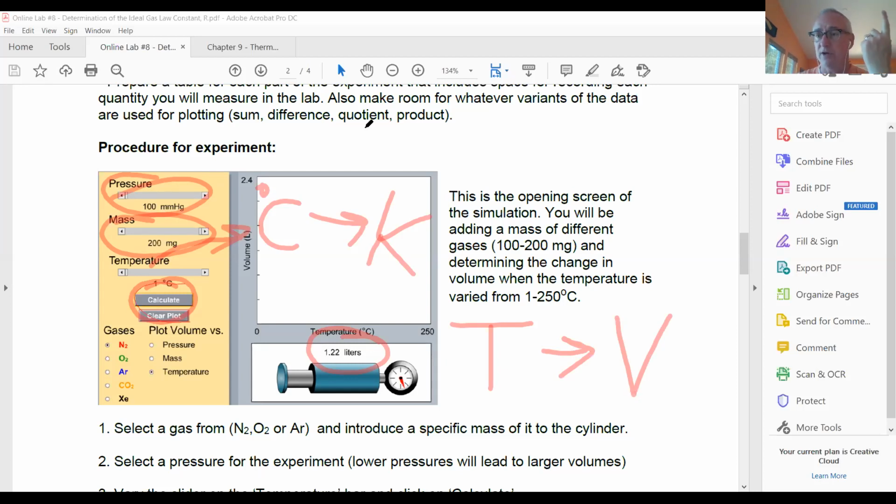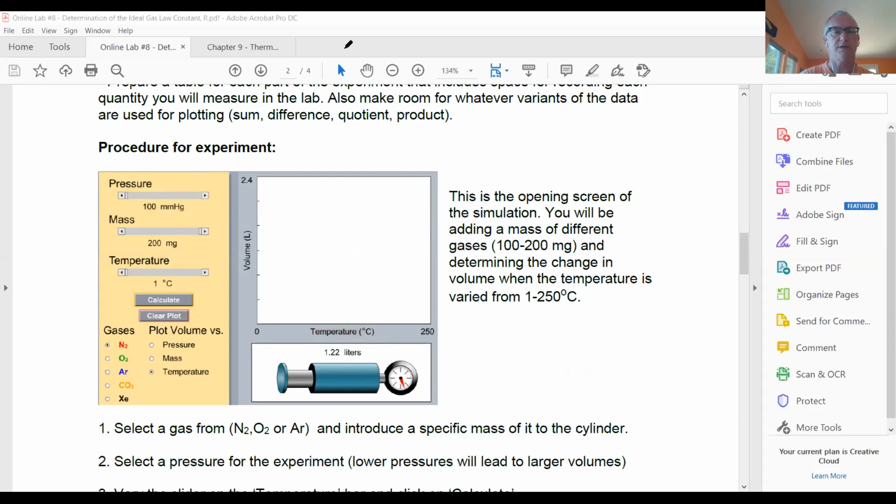And since the other 2 are going to be held constant, when we plot our data, we should be able to see the relationship between all 4 things happening at once. And if we see that, that basically will give us the value of R, because R is the thing that relates all 4, temperature, pressure, volume, moles, together. So let me clear that and move this over.